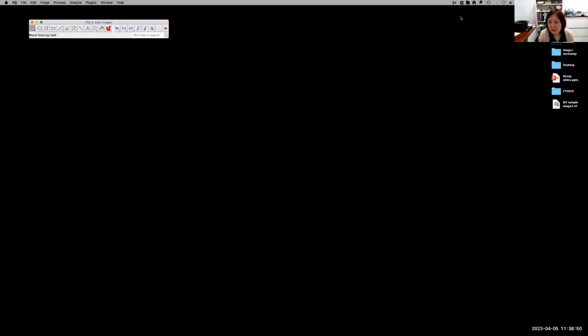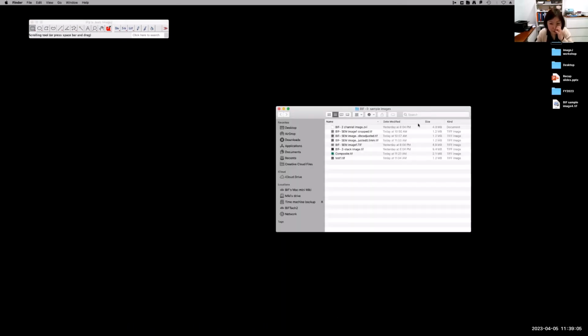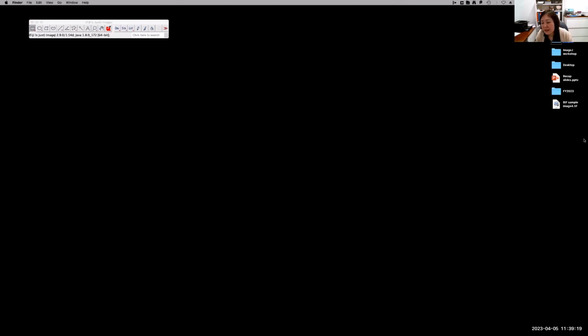All right. So I'm gonna go back to this 2-channel image. No, it doesn't have to be a 2-channel image.